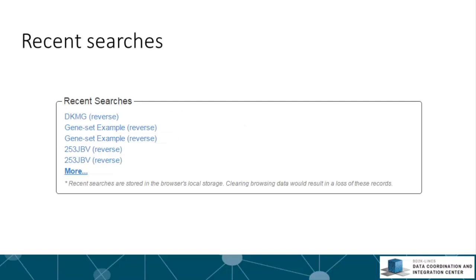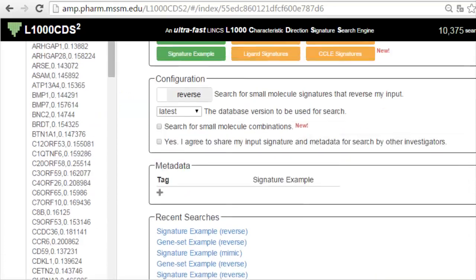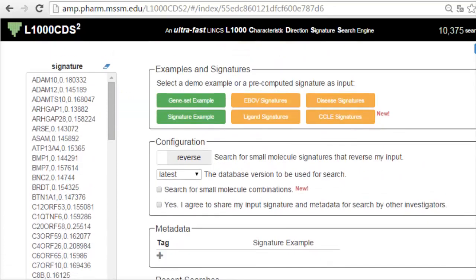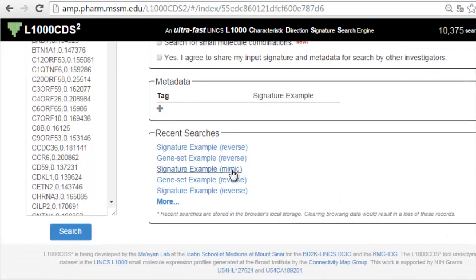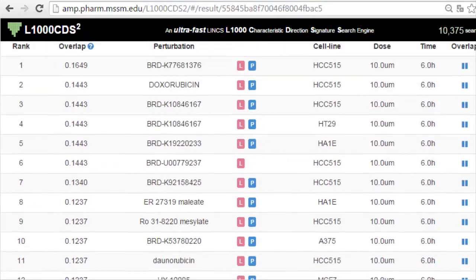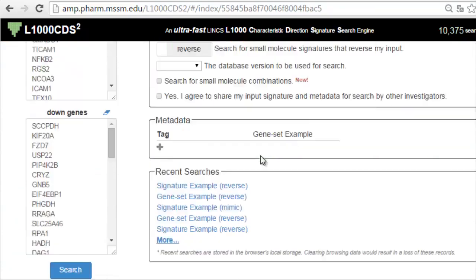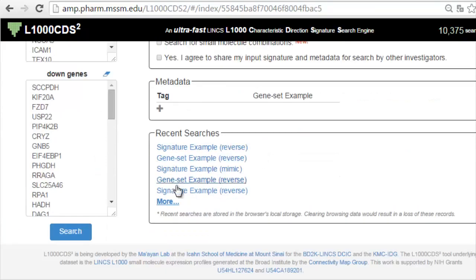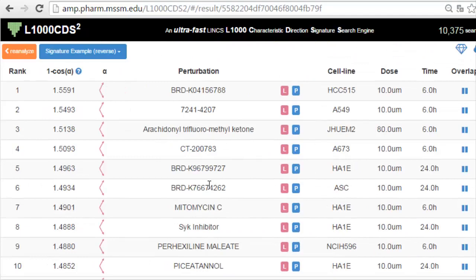The 20 most recent searches are stored in a recent searches section. Clicking an entry of a recent search will invoke search results in a new page. Note that those recent searches are stored in the browser's local storage, so cleaning the browser data would result in a loss of those records.